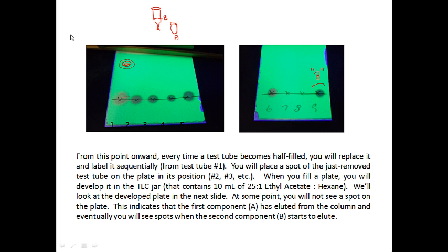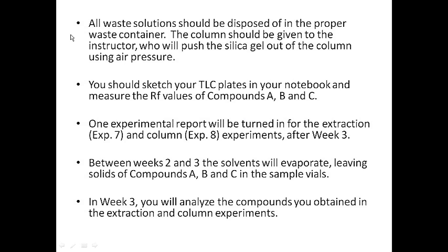Okay, that's one thing. We didn't really have to do that in the case of the spinach because they had a color to them, but in this case we have to circle the spots with a pencil in order to know where the spots were when we don't have access to this light.